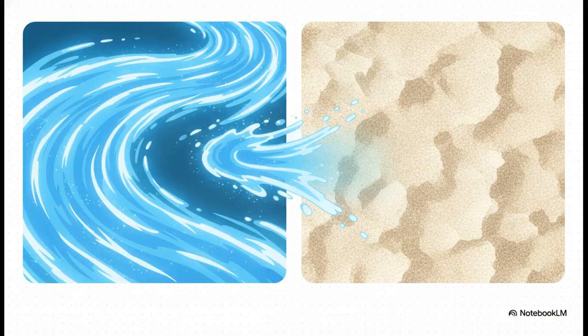Right, so all forms of chromatography basically rely on a dynamic relationship between two critical components, the mobile phase and the stationary phase. You can kind of think of the stationary phase as the terrain and the mobile phase as a river flowing right over it. In our specific TLC setup, the mobile phase is our liquid solvent. We're using a mixture of 95% ethyl acetate and 5% acetic acid here. The stationary phase, on the other hand, is our TLC plate, which is just a piece of glass or plastic coated in a very, very thin, delicate layer of an adsorbent material like silica gel. As the solvent travels up the plate, it just carries our chemical mixture along with it, separating the components out as they interact differently with that silica.